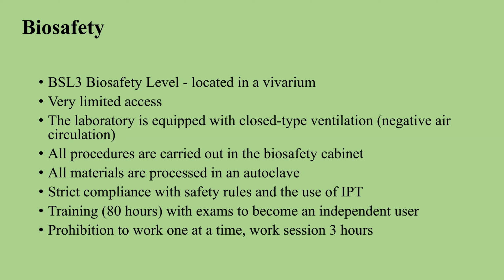The third level: labs have a vivarium and very limited access. Ventilation is of the closed type, so-called negative air circulation, with its own circulation inside.